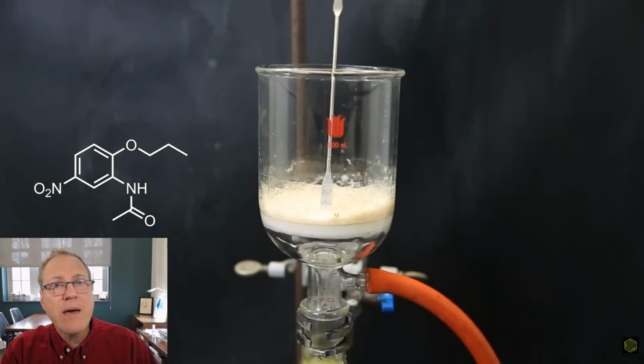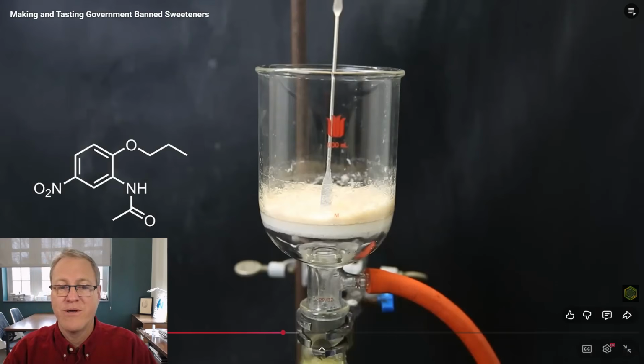So how much of that material on the screen does he have? Well, at most, he has the same amount of that material in terms of moles of what he put into the previous reaction. That was 29.5 millimoles at the most. So at most, he has 29.5 millimoles of that material.